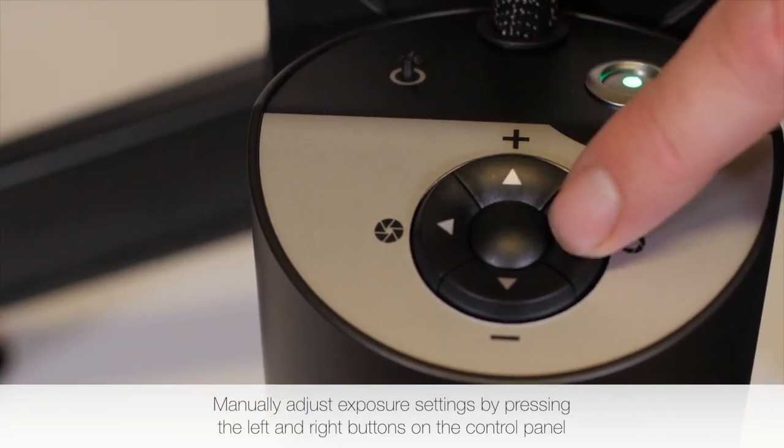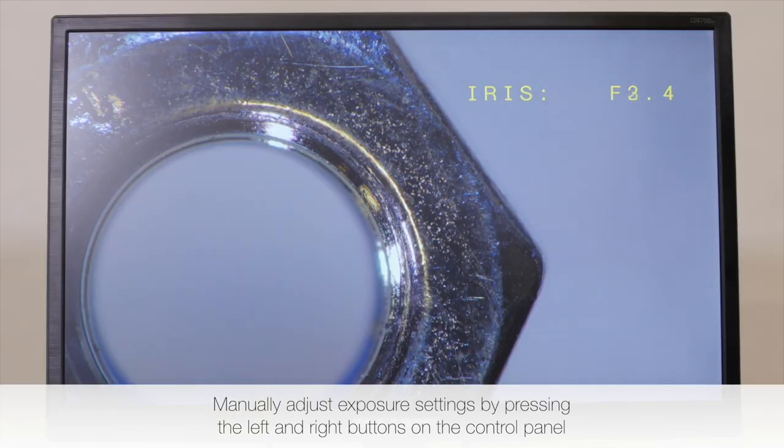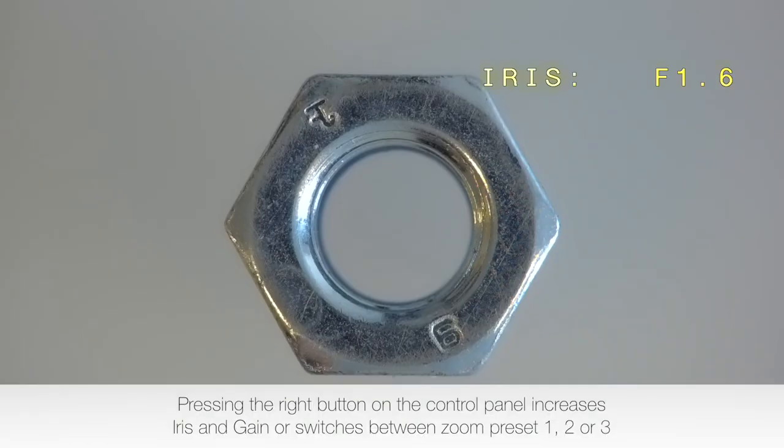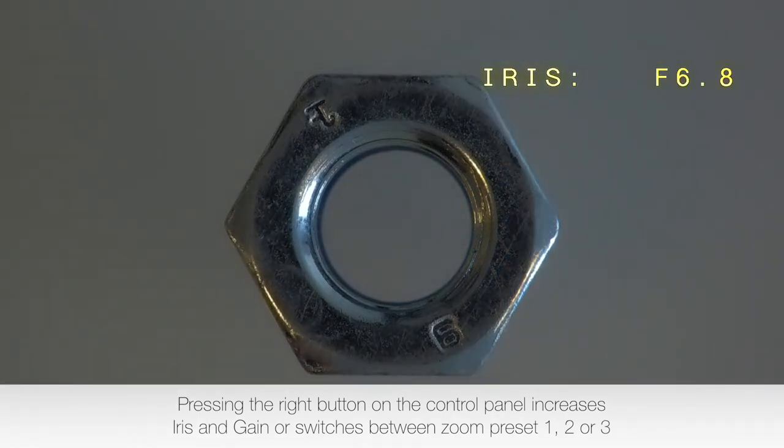Manually adjust exposure settings by pressing the left and right buttons on the control panel. Pressing the right button increases iris and gain, or switches between zoom preset 1, 2, or 3.